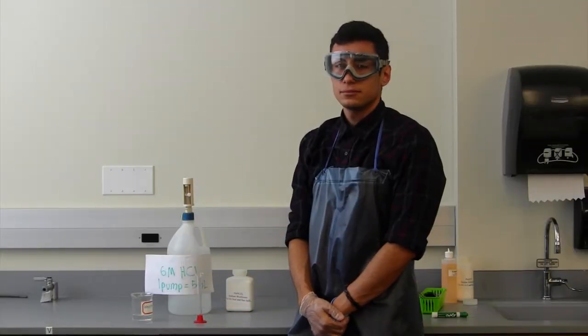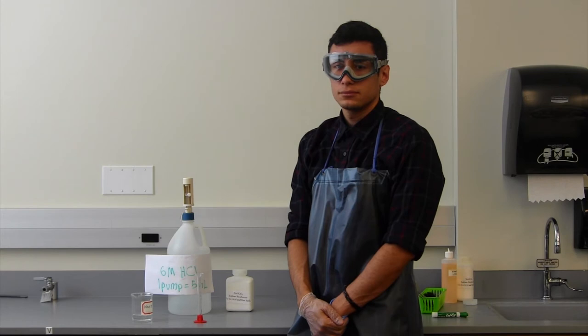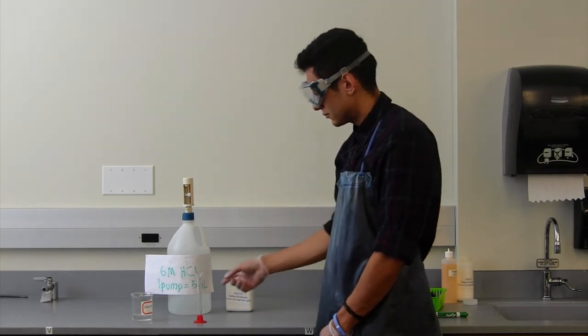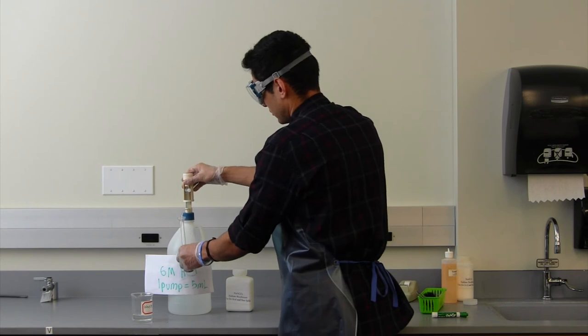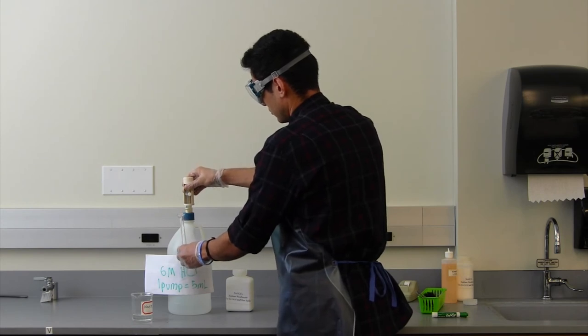Now it is time to cover some mistakes performed by eager general chemistry students, which although they are in good faith, are wasteful and destructive practices. The first mistake to be covered is overpumping reagent. This usually results from pressing the pump too many times.